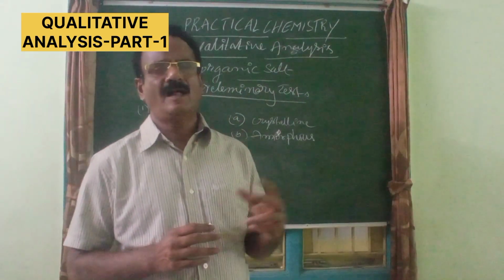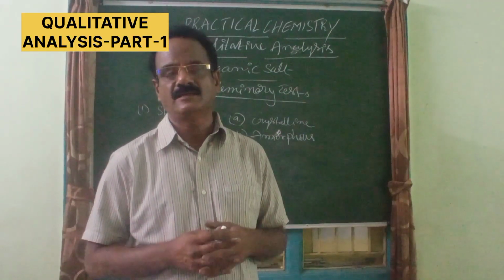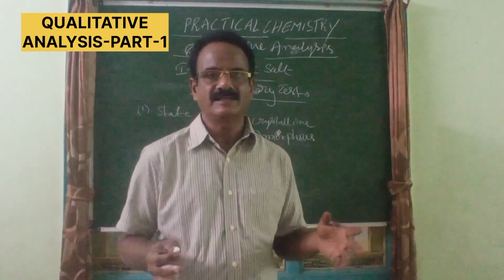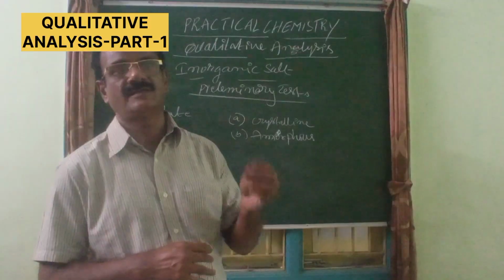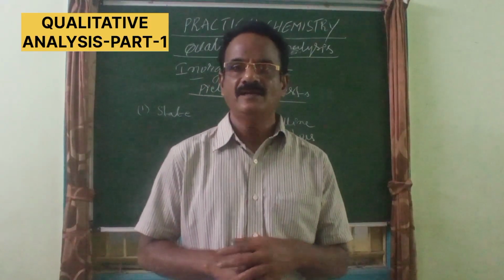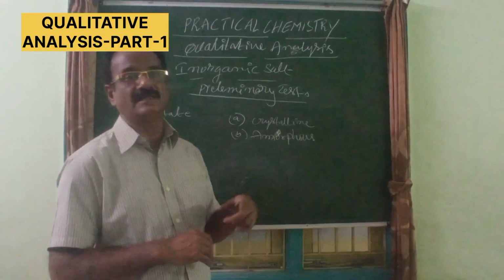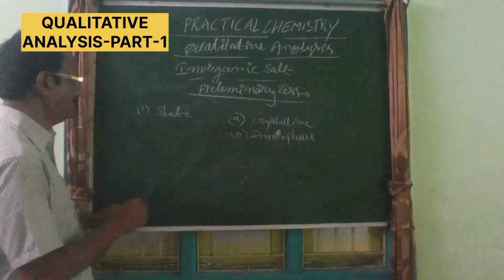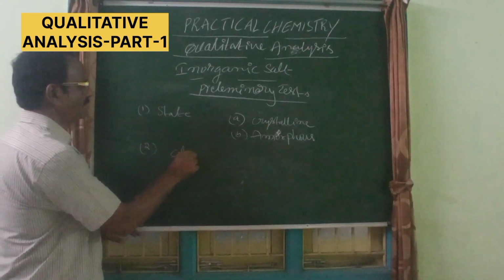Almost all salts given to the analyst, or to students in the case of colleges, are in solid state, so there is no issue about whether it is solid, liquid or gas. Our observation is confined to whether it is crystalline or amorphous. Is it clear? Now let us see another most important observation: color of salt.